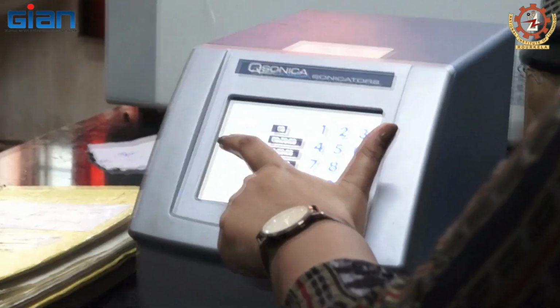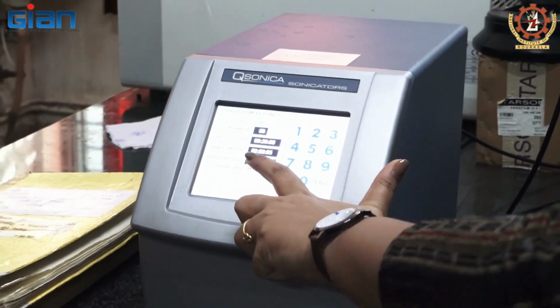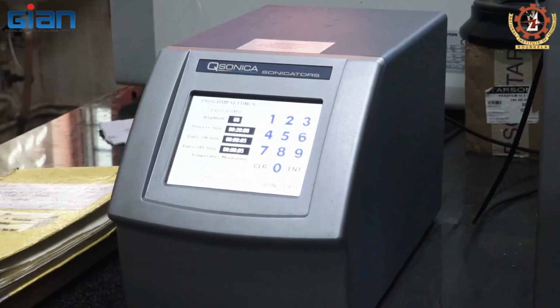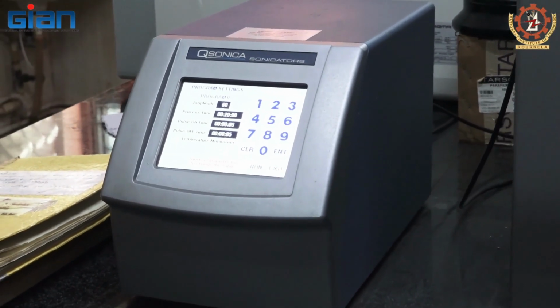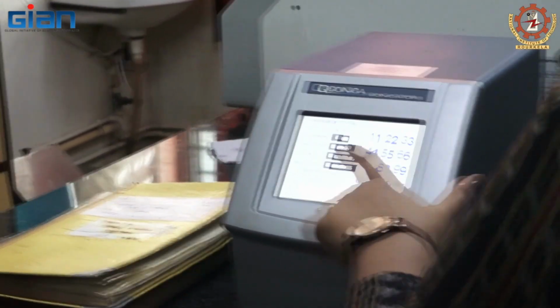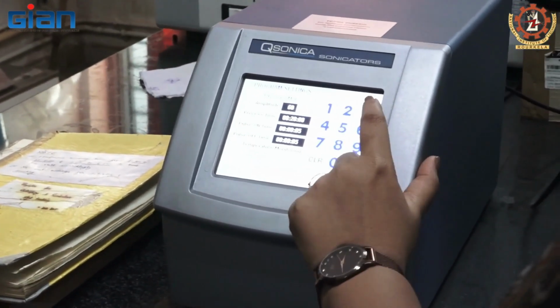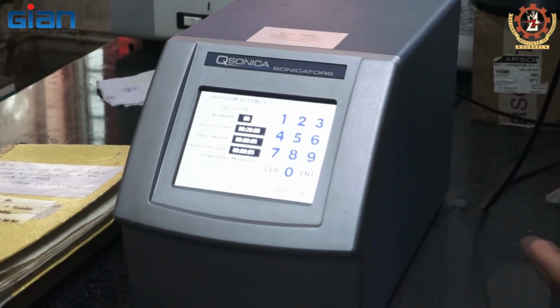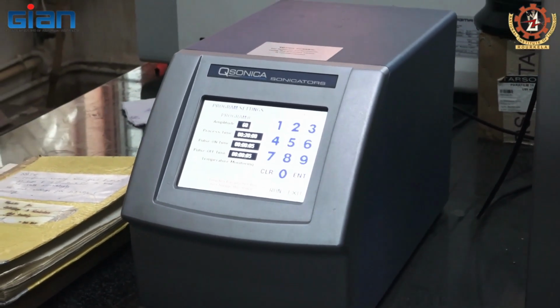It is the time, and it is the pulse on time and pulse off time. Pulse on means how much time you want to give the ultrasound, and pulse off is how much time you give it to rest. Okay, this is the 60% amplitude. Process time is 20 minutes. Pulse on means 5 seconds you have to give ultrasound, and 5 seconds it is off.